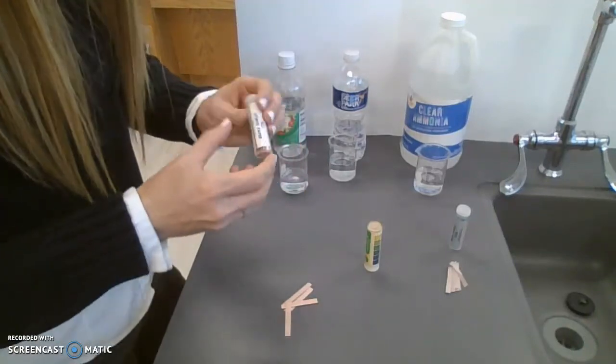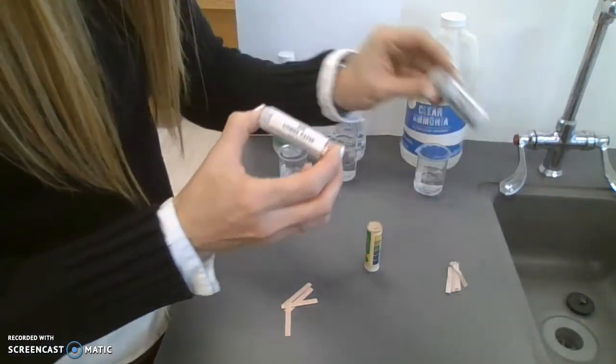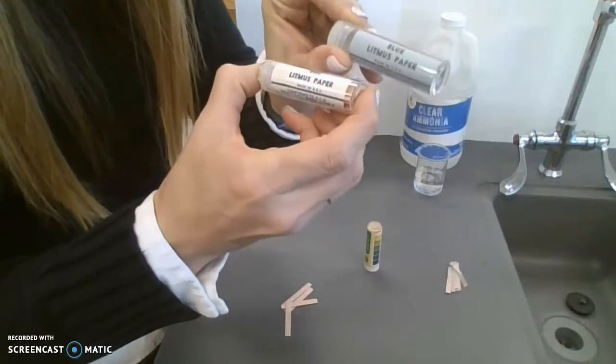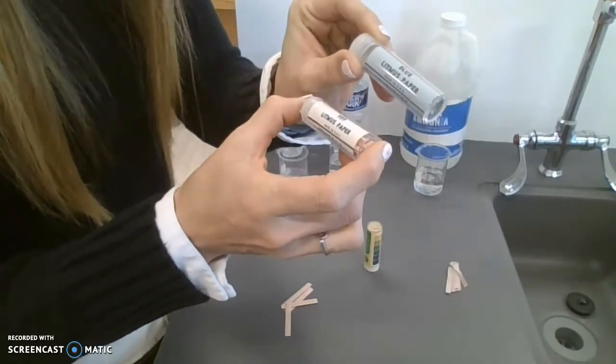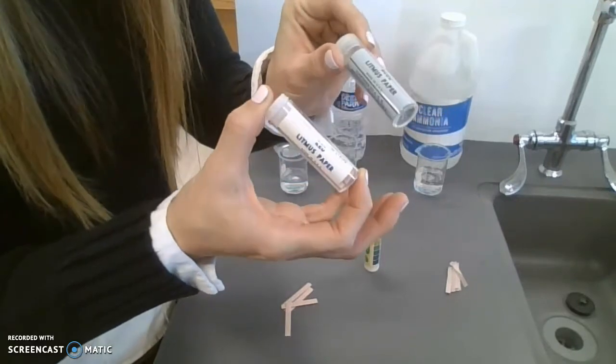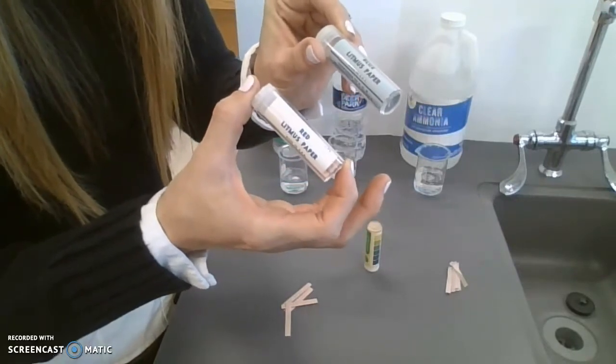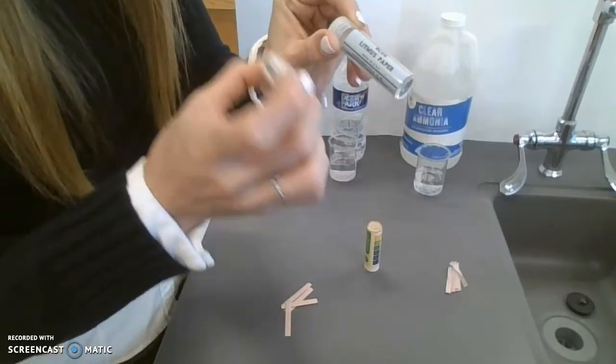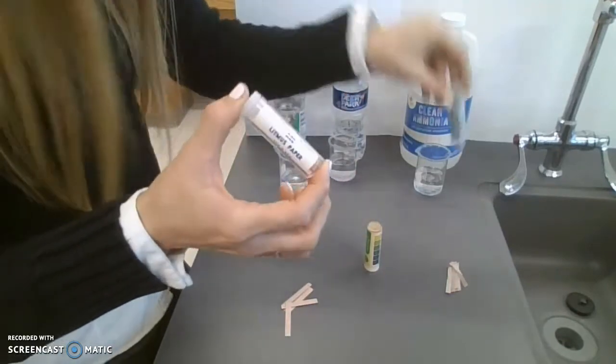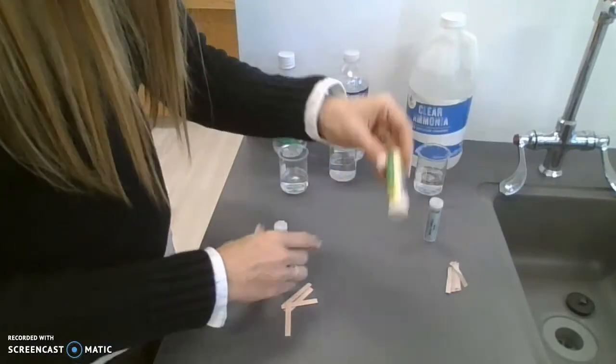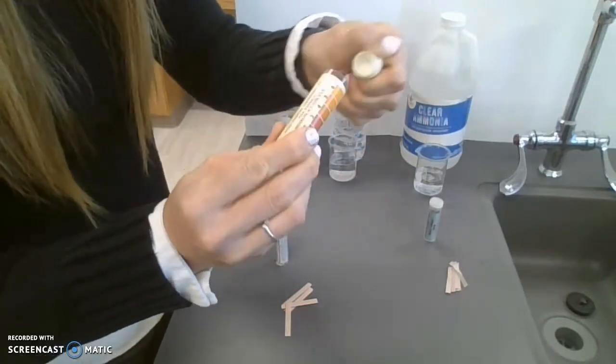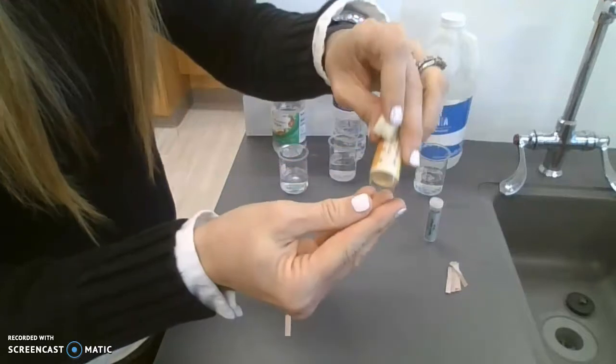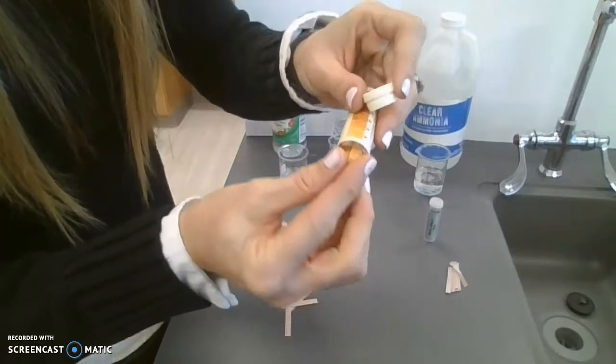Hey everyone, let's talk litmus paper. Litmus paper is filter paper that has been covered with an organic substance called litmus, and it changes colors based on what the pH is. So red litmus paper, blue litmus paper, and there's also this yellow litmus paper that is more sensitive and changes a variety of colors depending on what the pH is.